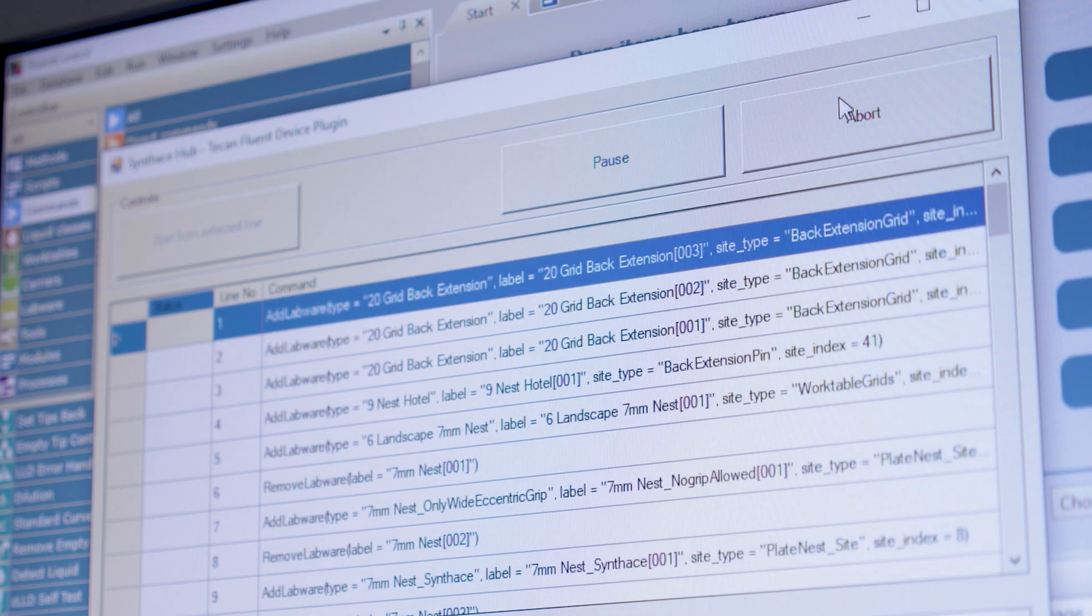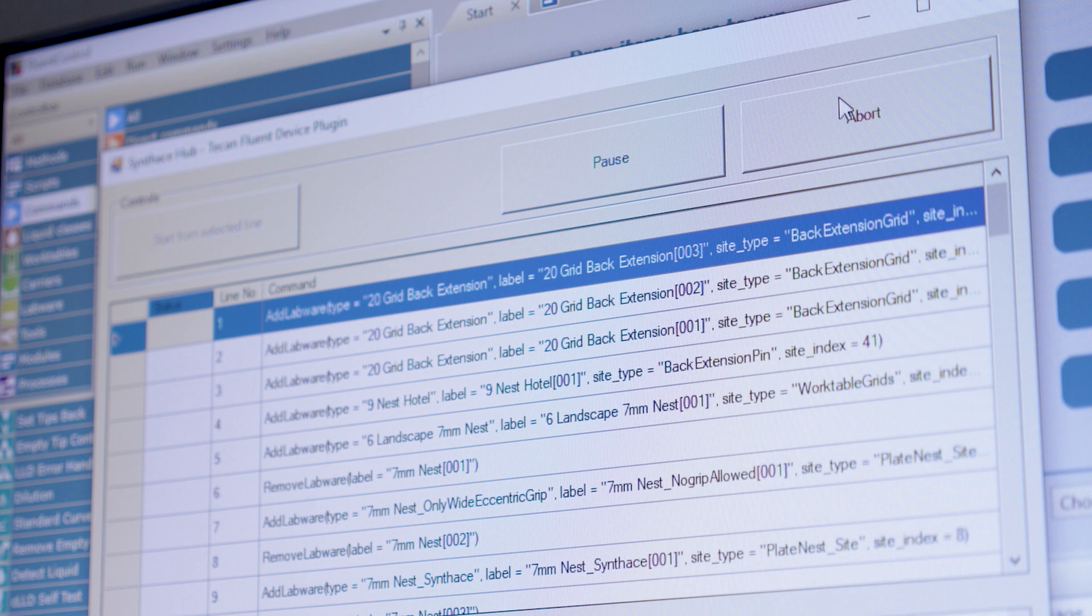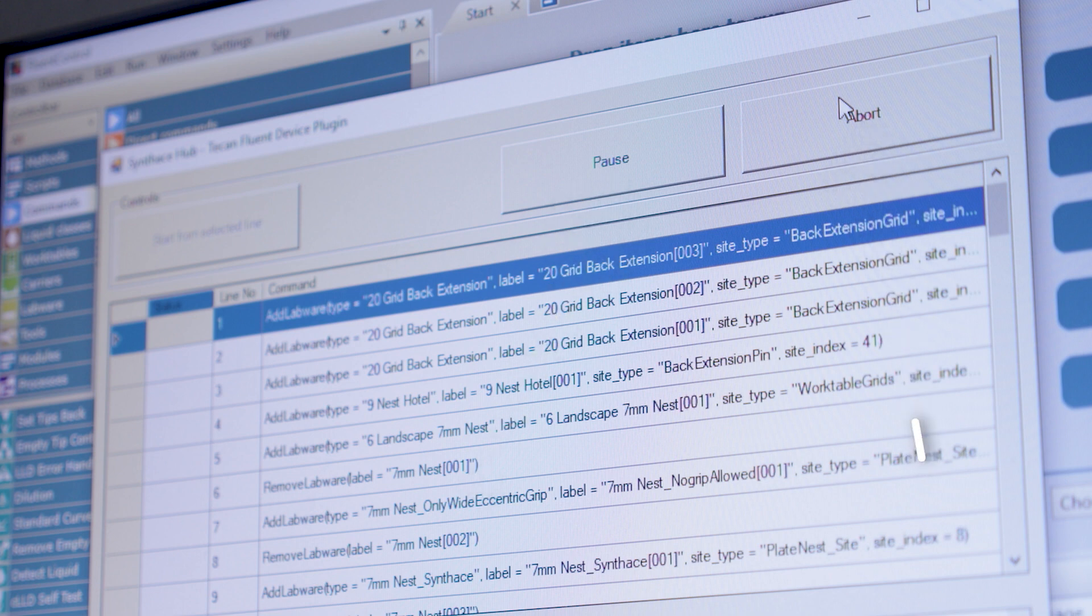The device plugin window will open. This shows all the actions that the Fluent is performing. To start the run just click start from selected line. After that you don't need to interact with this but you can use it to pause or abort an execution or resume from a specific line.